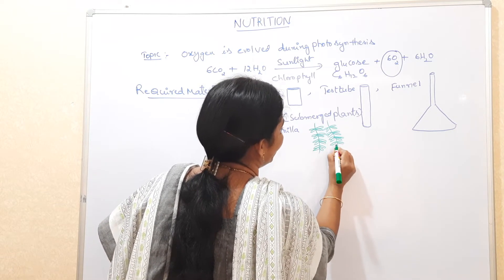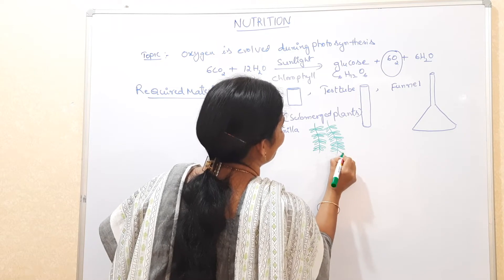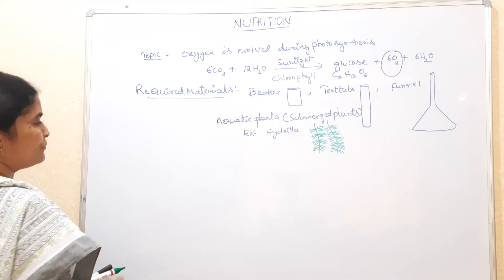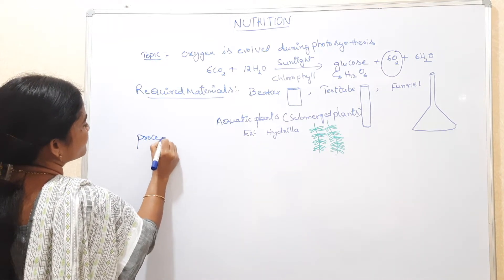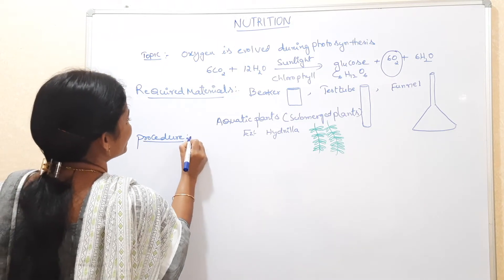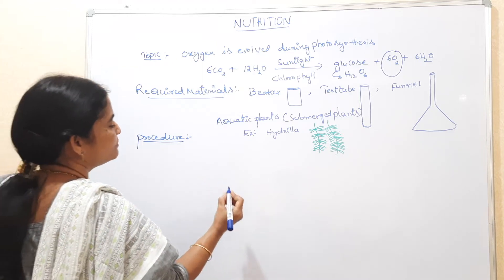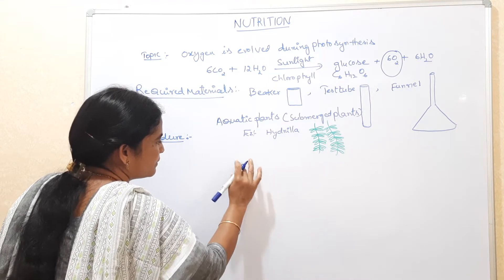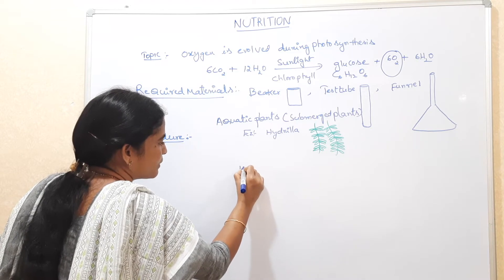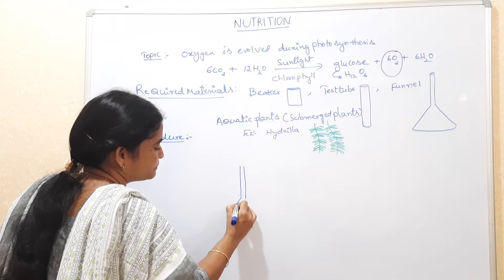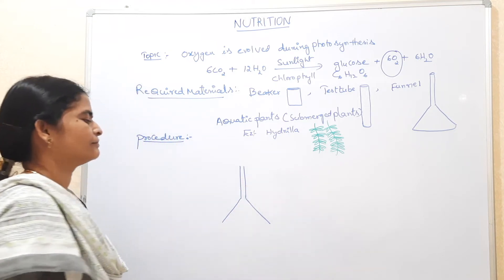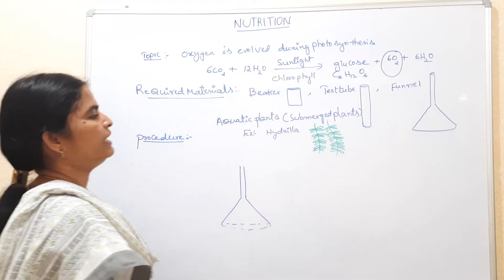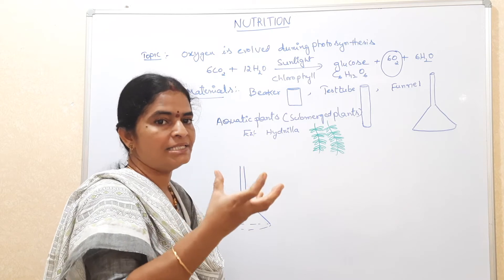We can take any aquatic plant for this experiment, but we are taking hydrilla here. Now we have to do the experiment. By doing the experiment only we can understand everything. First, take a beaker, then take the funnel. In the funnel we need to keep hydrilla plants — make a bunch of hydrilla plants.